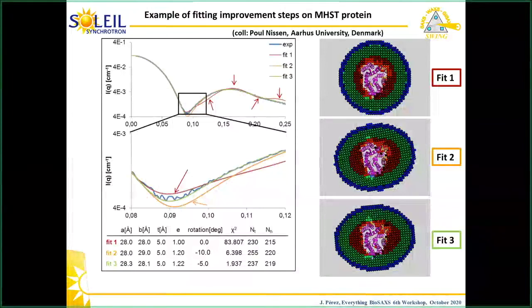As you can see, there is nothing here that reminds you of a molecule of detergent. We are just speaking of geometrical density here. We are filling density. So if this density corresponds to glycans, then no problem. Yeah. All right, thank you.